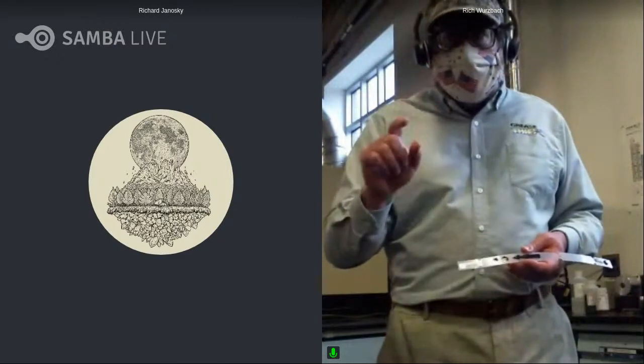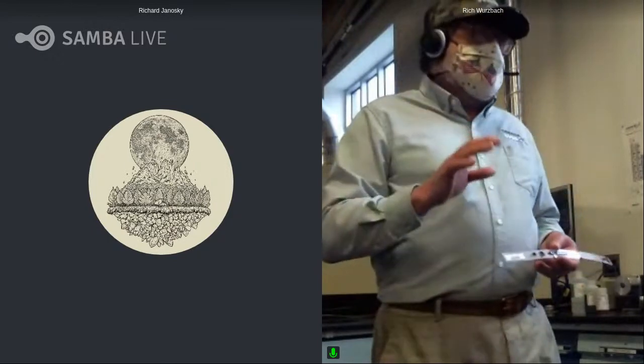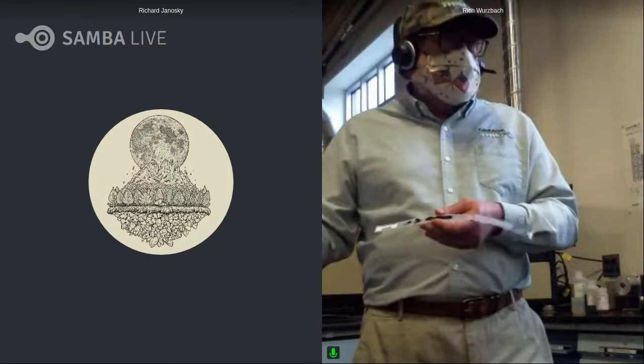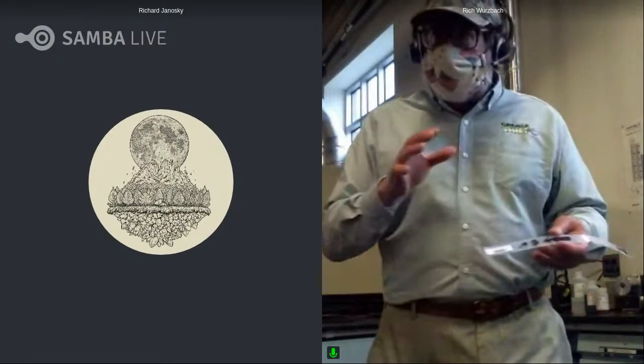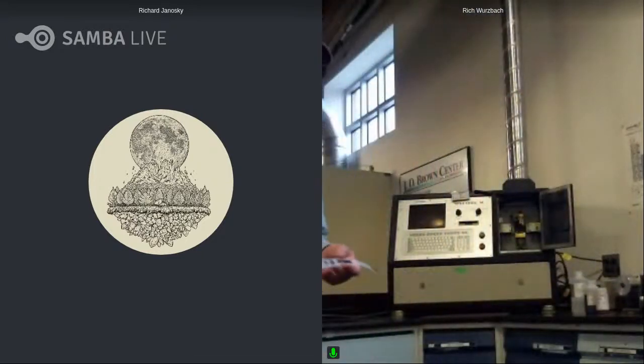This is different than an oil sample, in that an oil is going to have a different flammability impact than this preparation because of these lower fraction solvents. You're going to see some differences in how you might do oil. But I'm going to ask Lisa to show us on the Spectro RDE machine.